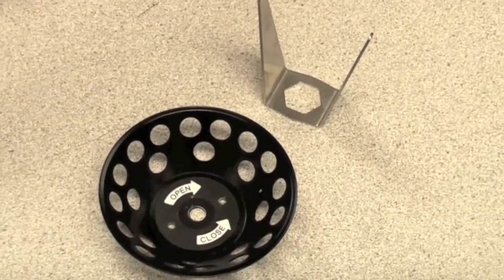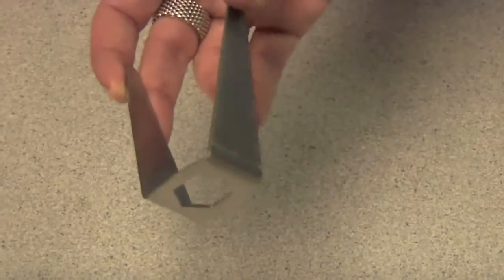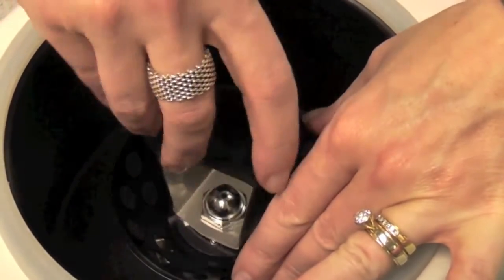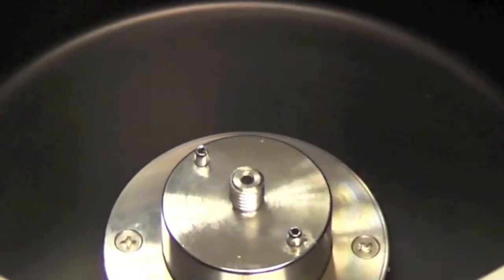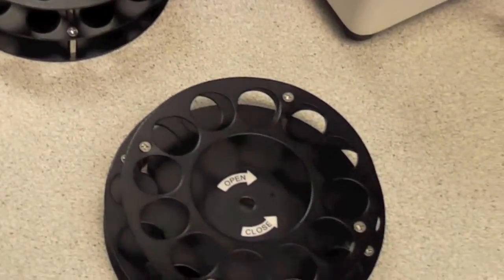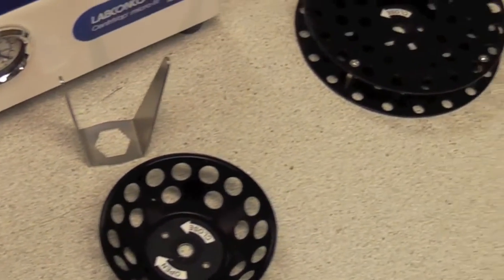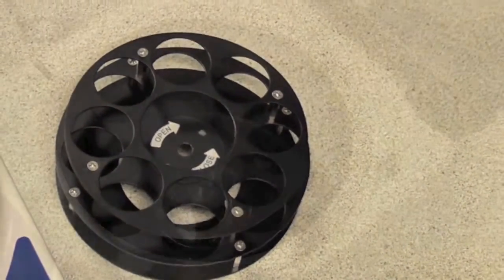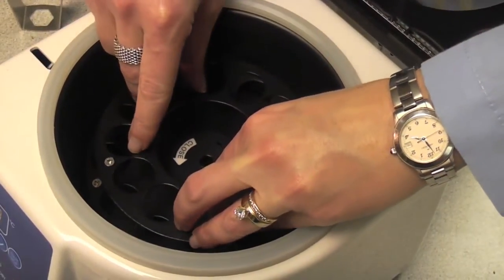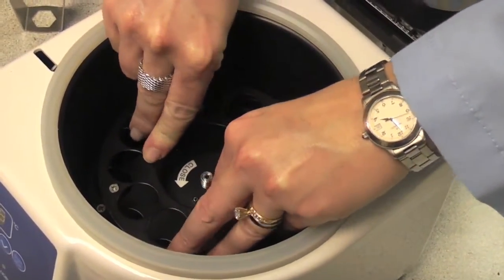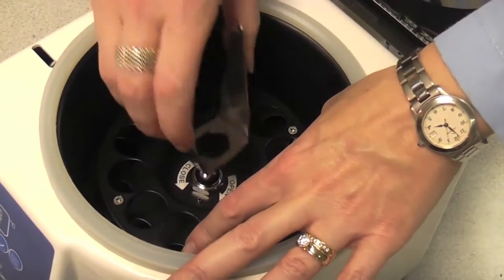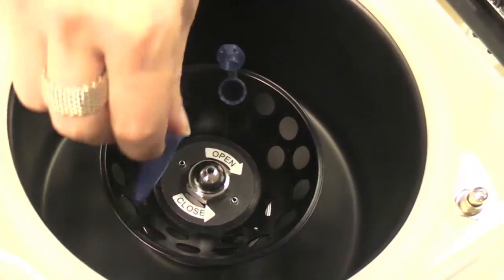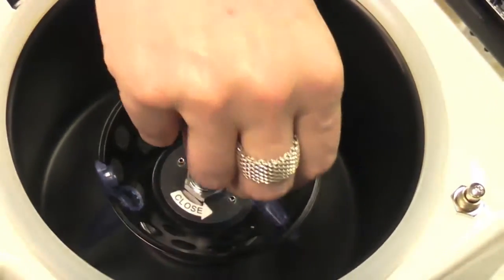The aluminum Teflon-coated rotor for 24 1.5 mil tubes is included. Four additional rotors are available to accommodate various tube sizes. The rotors hold the sample tubes at an angle to maximize the surface area.